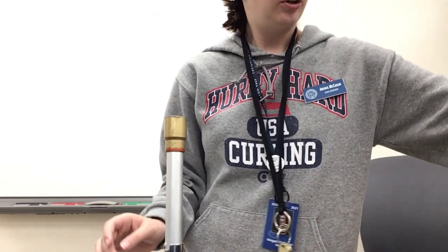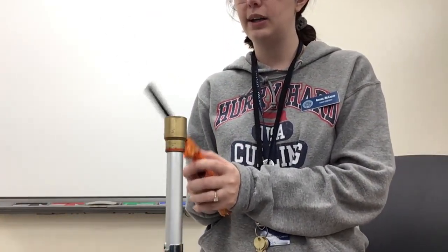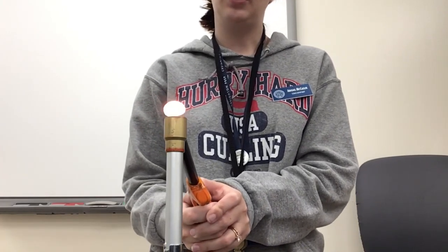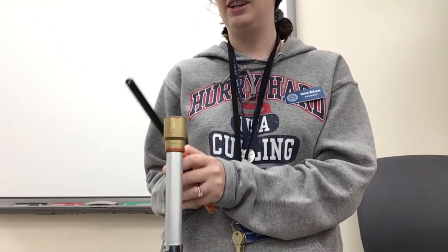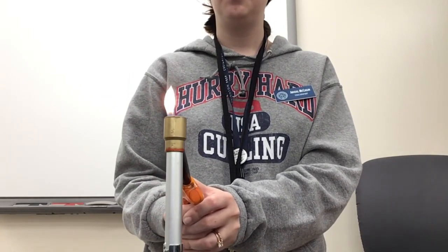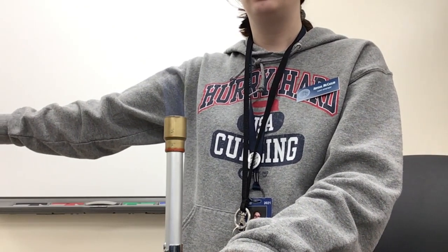When I light my Bunsen burner, I'm using a lighter and this is important for you to know when you come back. You turn your lighter on, you come from the bottom, you turn it on, you come from the bottom, and then you get a light. It might be hard to tell. You can kind of see right there.